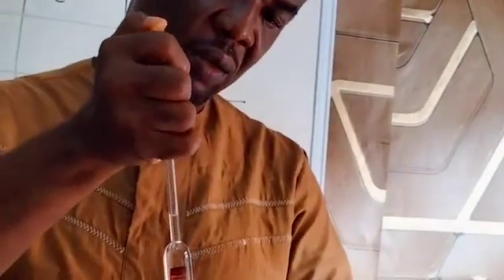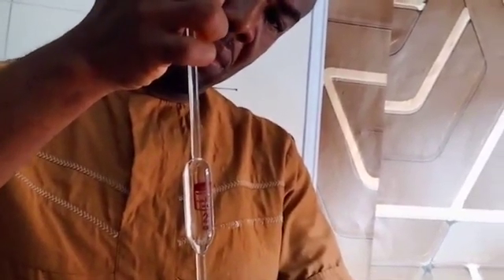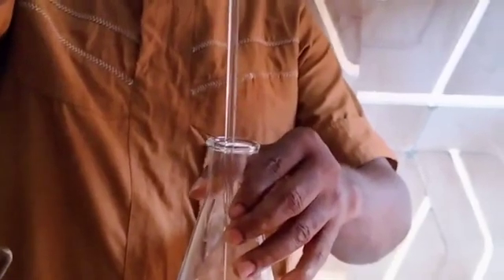So we have 25 exactly now. So you now move it to the conical flask. Allow it to move to the conical flask. That is the solution B.